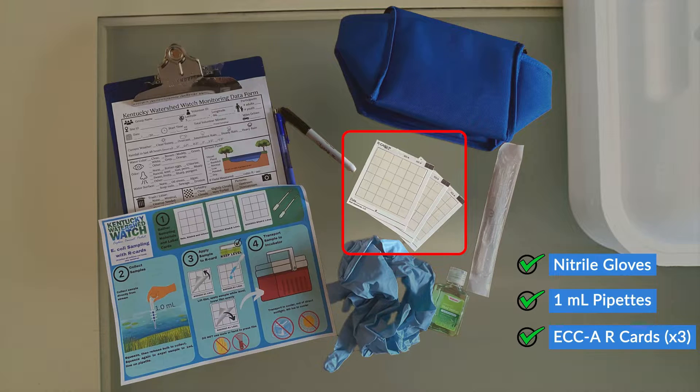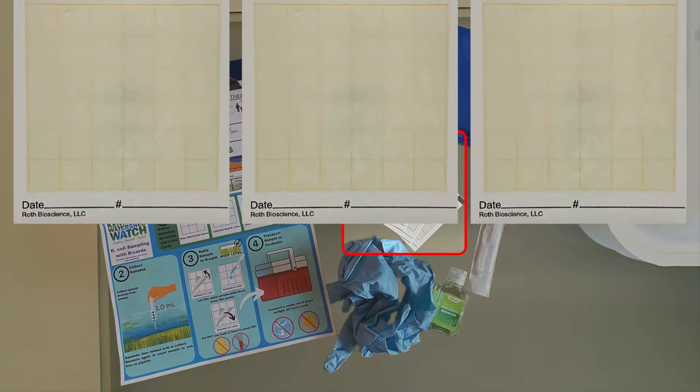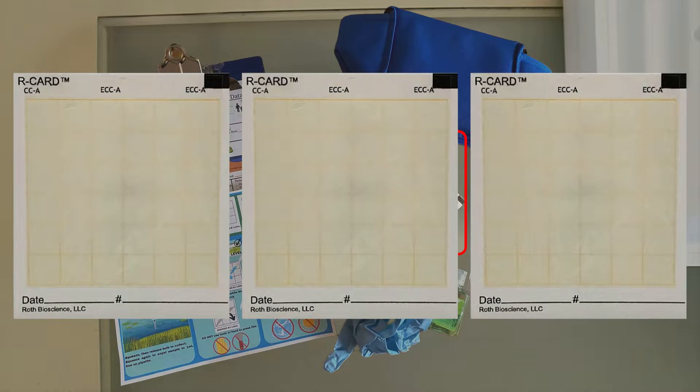You'll also want to pack three R-cards. These R-cards are designed for the rapid detection of E. coli and coliforms. For quality control, we use three R-cards at each site, which allows us to obtain an average result to improve the accuracy and reliability of our test. We recommend that you pre-label your cards with the date and site ID. For example, our site is named site number one, so we use the alphanumeric labels site 1a, 1b, and 1c to distinguish between the samples collected at that location.